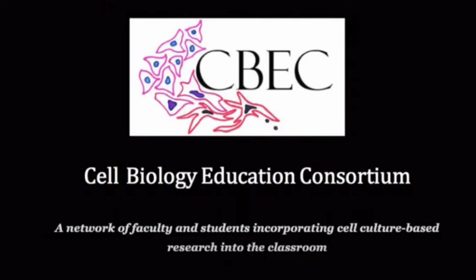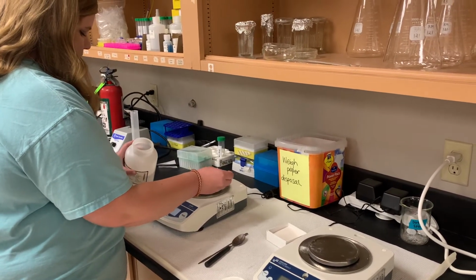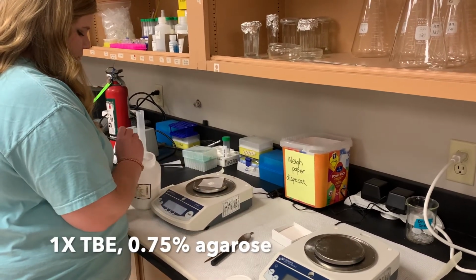In this video, you will learn how to prepare, run, and interpret a gel. First, make 30 milliliters of agarose. For this video, we made agarose that is 1x TBE and 0.75% agarose.